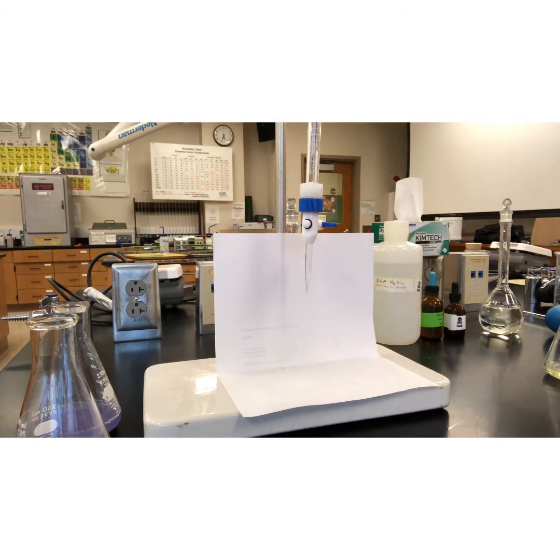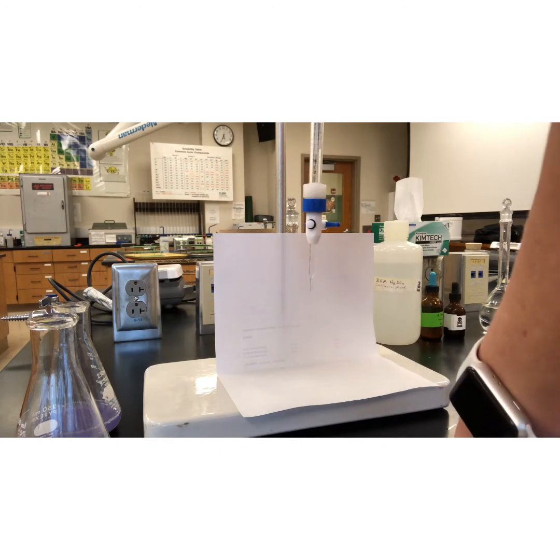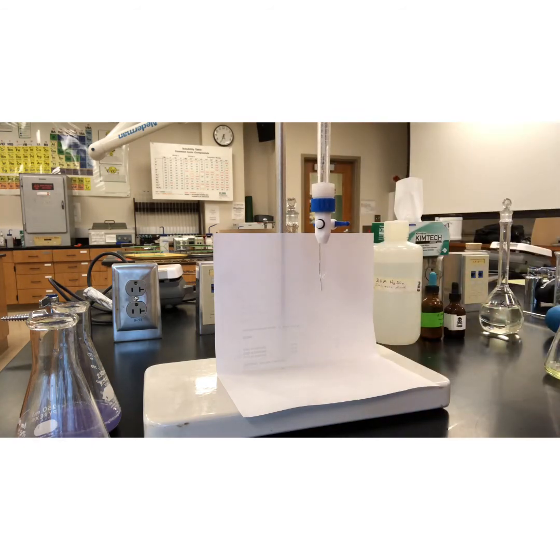Note my V naught, my initial volume. My initial volume is 1 point, let's see, where am I at? Not leaning in front of the camera, I thought it was. 5, 6, 7, 8, 1.80 milliliters is my V naught.